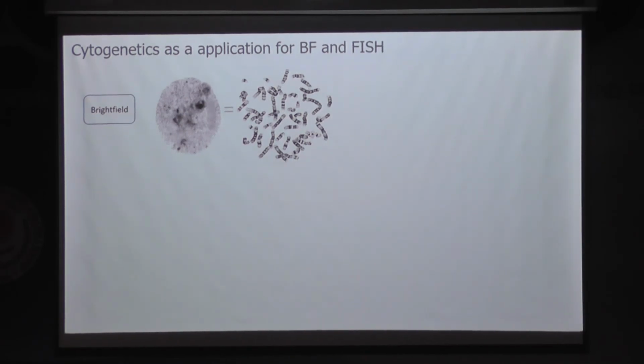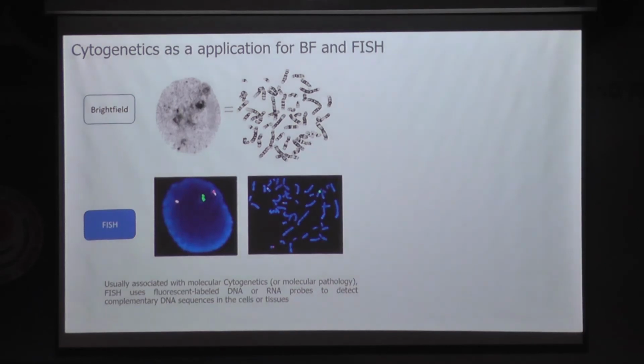I find a metaphase at 10x and then capture it at 40x, and with the help of software I make it into a karyogram, arranged from the larger size to the smaller size, so that clinicians can understand what the issue is with this particular karyotype, what is getting repeated, what could be the cause, and what treatment has to be given.